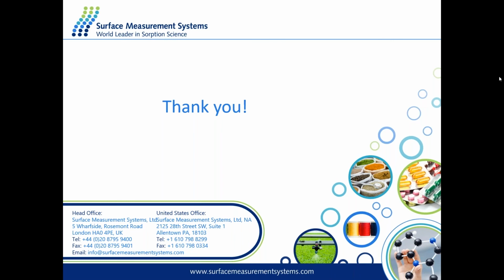Thank you, Edgar. Another question we had: do particle size or particle size distribution also affect the temperature and humidity at which caking takes place? The particle size distribution is normally not the big influence on the caking process.